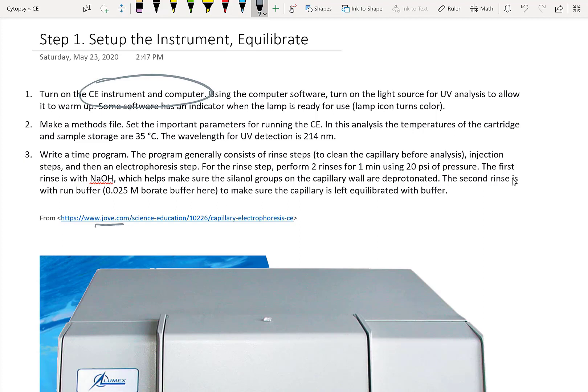Step two is to make sure that the temperature of the sample and the cartridge is set properly. The temperature affects how easy it is for the liquid to flow, and we want to make sure that the same temperature is used across many different runs. So let's set it at a standard 35°C. Additionally, you can see here we're setting a UV detection wavelength. This is because our detector is a UV detector in this protocol, and it's going to measure samples via double bonds at this 214 nanometer wavelength.